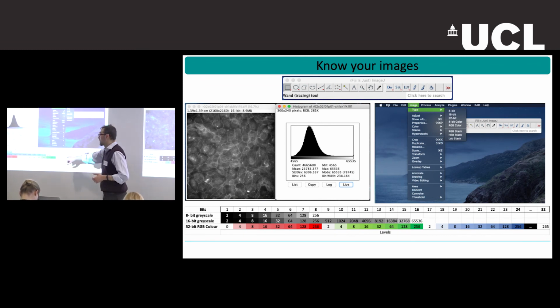In this space, you can represent a lot of colors, I think a few million, 4 million or something. But you have to think about what you are really looking for, because if you're looking at a single channel for the segmentation problem above, it's probably better to have three black and white images that are the three things you are analyzing. And this is what Operetta does. It keeps everything separate and at maximal resolution.